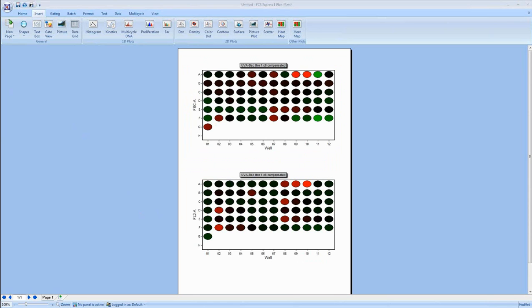Now, what you may be asking yourself is, what do all of these different colors mean? And what these colors mean is red is hot, or red has heat to it, or it's a high value. Green is low. That means it has a very low value. And the black in the middle is something, again, that falls around the median of this data. And let's take a look at what statistics we're actually viewing here.